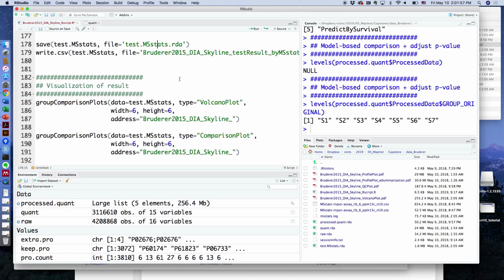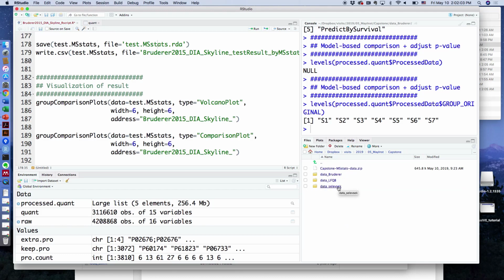Okay. And then I will go ahead to another data set because I want to show something else. So for here, slabs, I don't know how to pronounce this name, but there are two folders. As Brandon explained, we have two different processing procedures we perform. One is to use everything, and the next one we filter out all the features which have more than 20% CV or something. So we have two different inputs. So what I did is start with the two different inputs and then go through everything in MSstat, the same steps, and then compare. What's the difference? That is what I did.